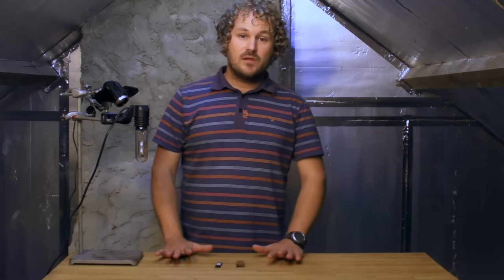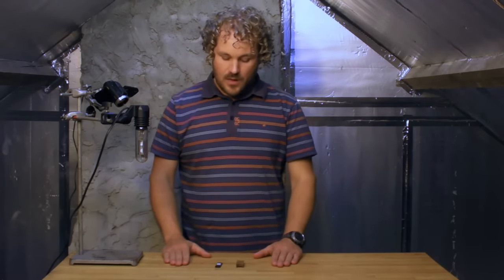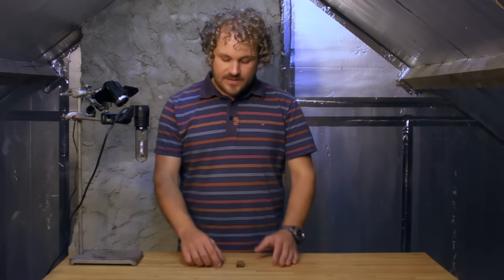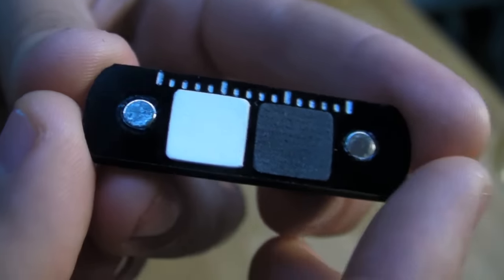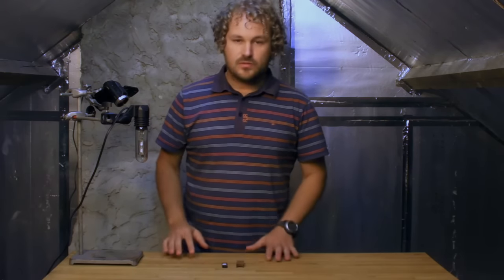If you're photographing in UV, then your choice of standards is much more limited. Spectralon is the best material, but there are lots of other sintered PTFE-based standards in different levels of reflectance. So this is a standard made from sintered PTFE, and here we have a 5% reflectance and a 95%, so it's useful for simultaneously taking photos of bright or dark objects.